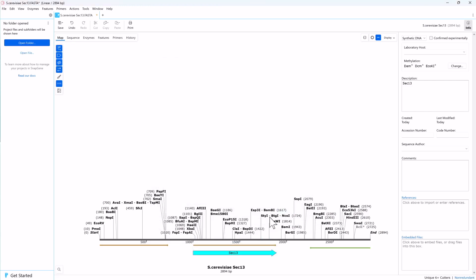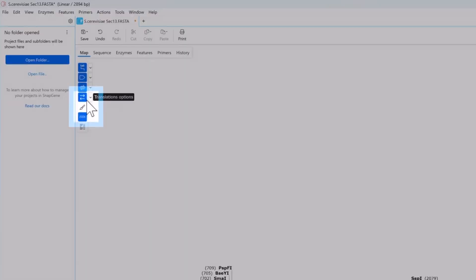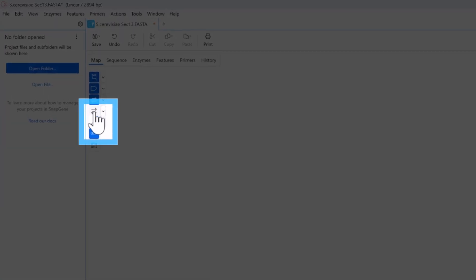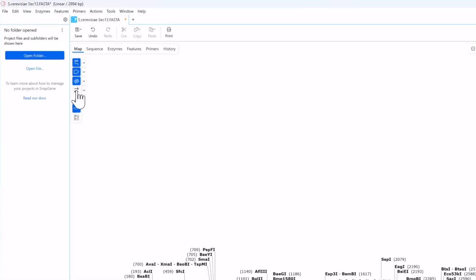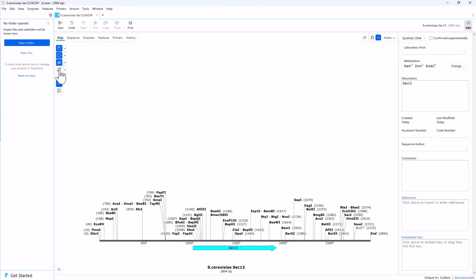You can see the added feature indicated by the arrow labeled sec13. Finally, turn off the open reading frames by toggling the Show Translations button. Now only the sec13 CDS feature is visible.